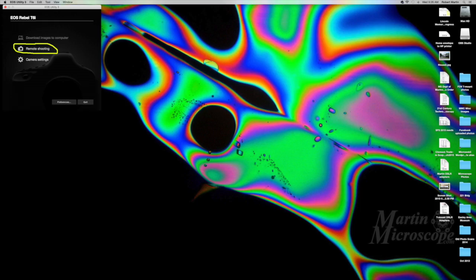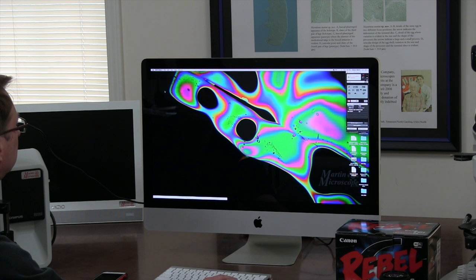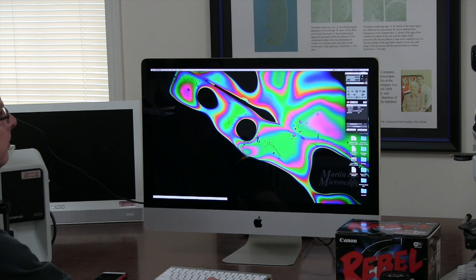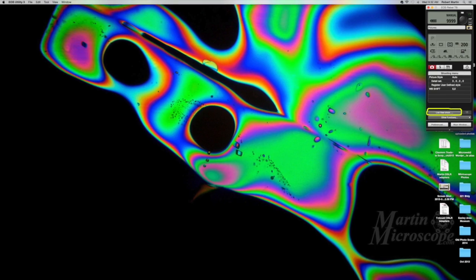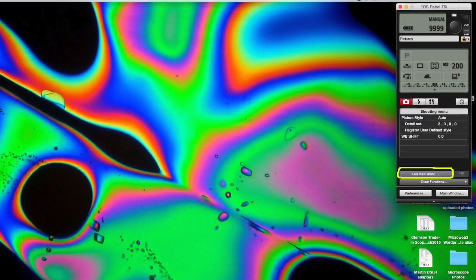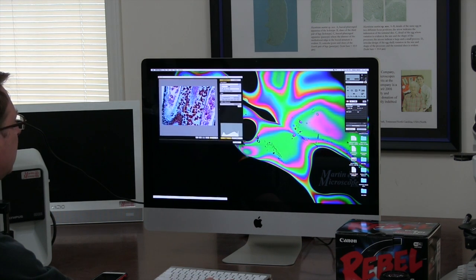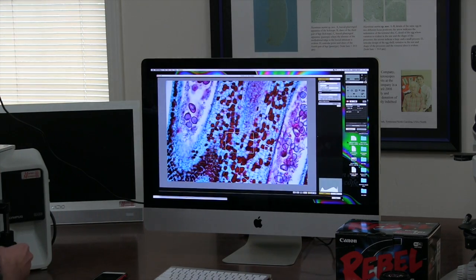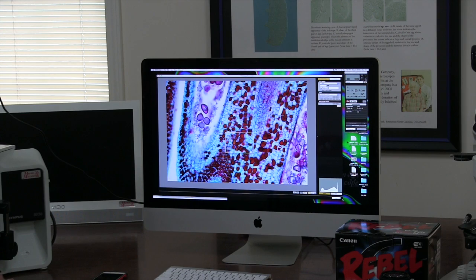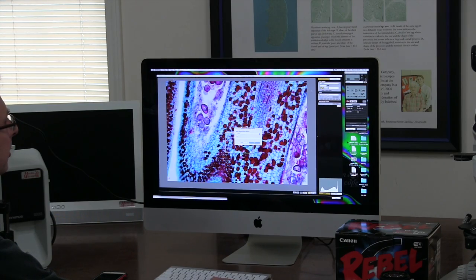I'm going to choose remote shooting, and then I get a window over here. I'm going to choose live view shoot. This is my live window — I can make it bigger. So this is what I'm seeing in the microscope right now. I can do a white balance; I don't really need to, it looks like it's already good, but there's a white balance dropper here.